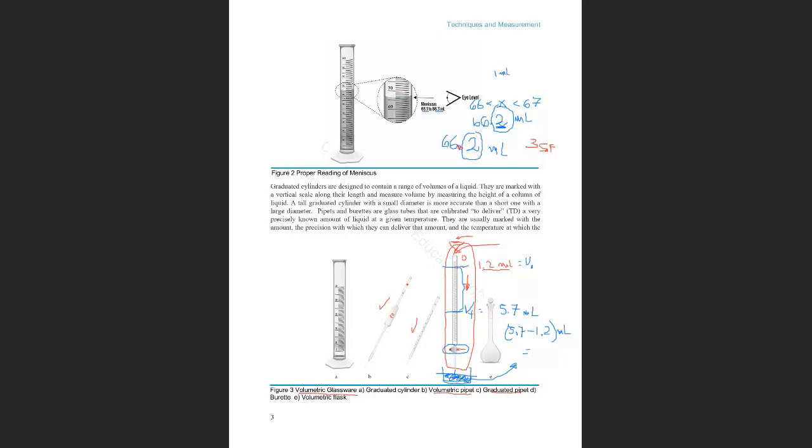So what is that? Yes, thank you. So this is what you will have to use in the report. We'll go over it later, but this is how you use a buret. You look at the initial volume and the final volume. And it's a mistake to try to align the volume exactly at zero and measure only one time.